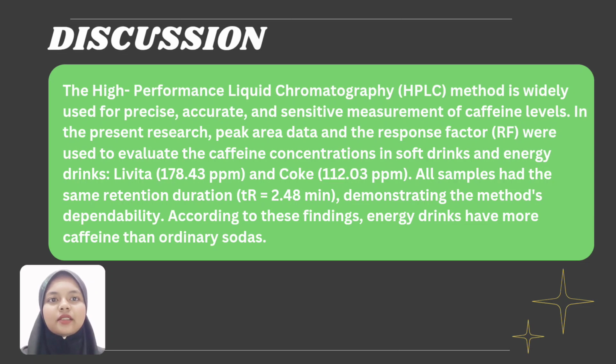Next, discussion. The high performance liquid chromatography, HPLC, method is widely used for precise, accurate and sensitive measurement of caffeine levels. In the present research, peak area data and the response factor were used to evaluate the caffeine concentrations in soft drinks and energy drinks.